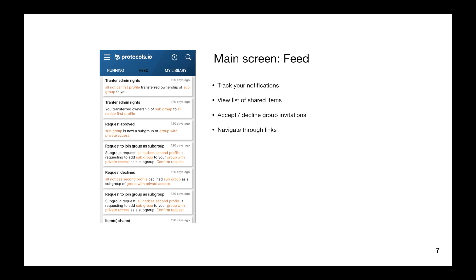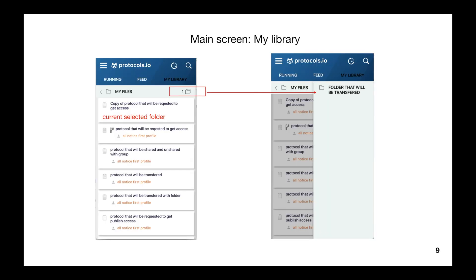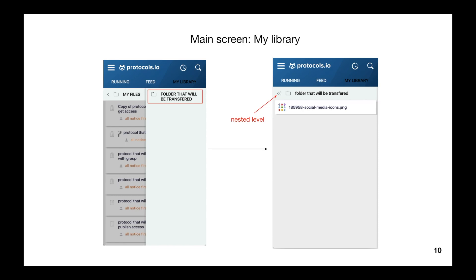For all other components, you will be redirected to our website. Next, the My Library tab, also called the file manager. It consists of all user subfolders and their files. On top of the list items, you see the current selected folder. The right area with the doubled folder icon opens the list of subfolders. Tap any subfolder to view content. A small arrow indicates the folder nesting level — one arrow for top-level folders, two or more for subfolders. Tapping the small arrow works like a back button. Selecting My Library tab always opens the top-level folder.